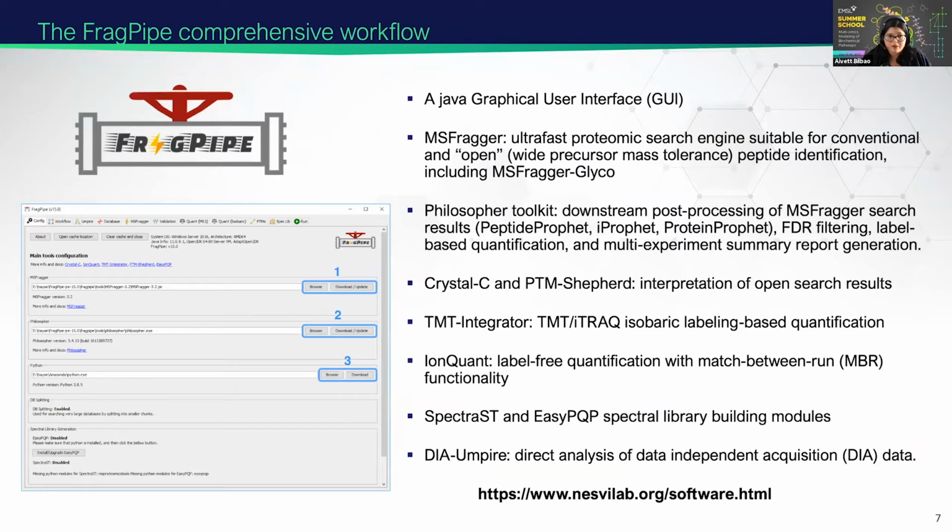Here I would like to mention FragPipe. Historically, the tools for proteomics have been developed in a step-by-step or isolated fashion according to the different steps in the workflow that you saw before. There is now an improvement towards making tools that are more comprehensive, where everything is integrated, so they are more user-friendly. You can analyze your data in a more reproducible way.